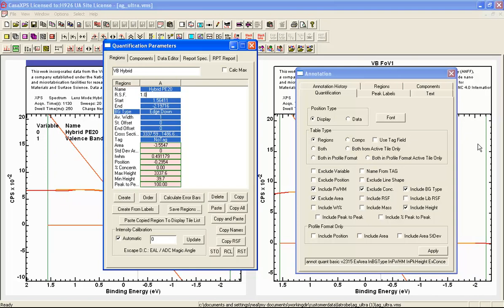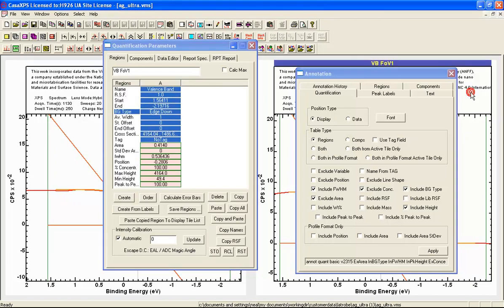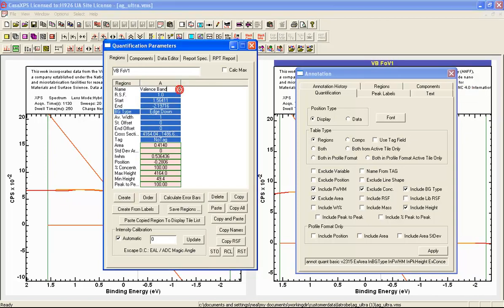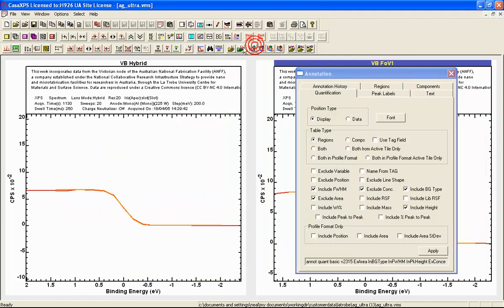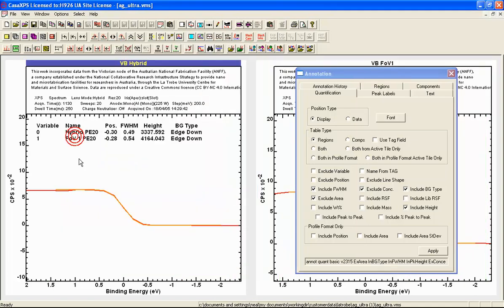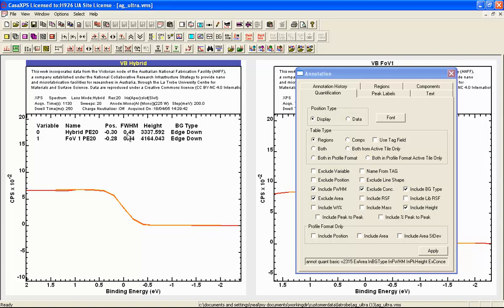And the other one represents the field of view 1, pass energy 20. So we can see here we've got the comparison indicating we've got hybrid is in this case tuned so that we have a better edge resolution than the field of view 1.